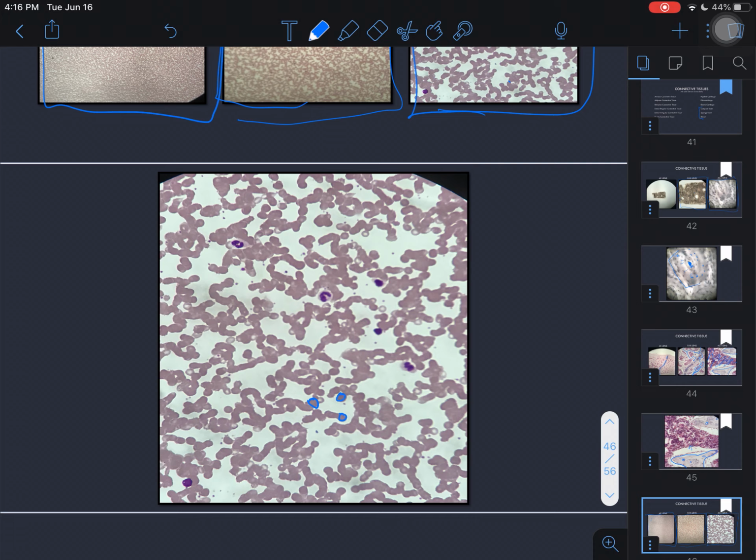Now, what's so distinctive about red blood cells is they don't have a nucleus. They're basically a donut, and this inside part, even though it's not hollow, it is empty, so that if you look at it from the side, it's not hollow, right? There's still the cell membrane there, but there's nothing in it, so it's nice and flat.